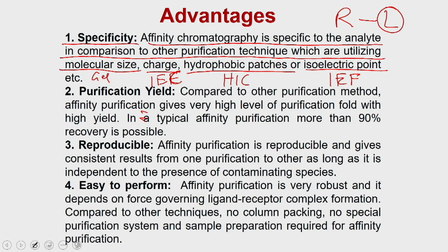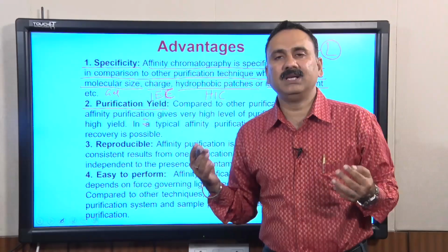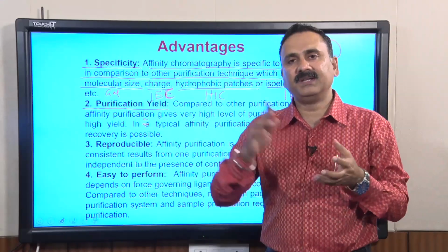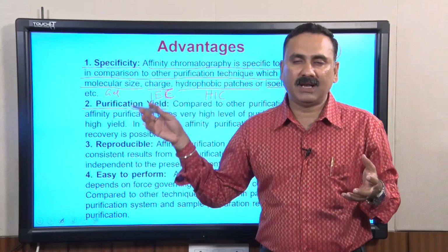And the second advantage is the purification. As far as specificity is concerned, when you use ion exchange chromatography, you are exploiting the affinity between a positively charged matrix versus the negatively charged analytes.